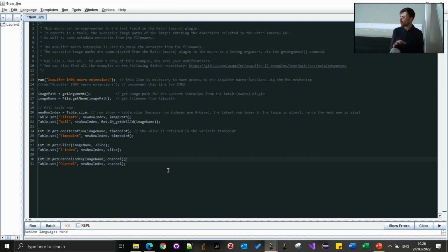You might wonder why my script editor is black. It's just a new update of the script editor. You can go in the options. It's just nicer for the eyes, I found, at least if you spend a lot of time.